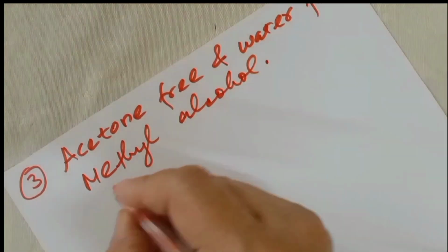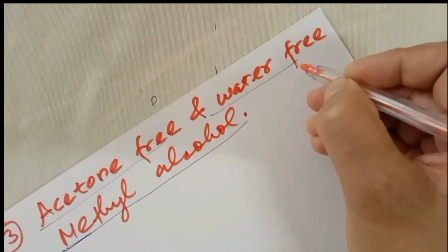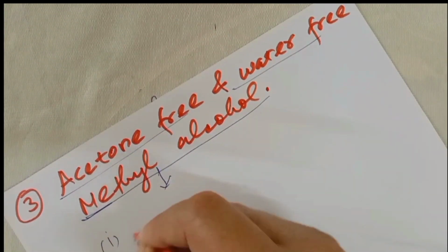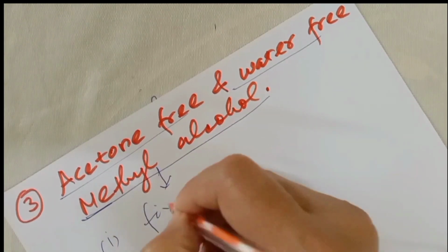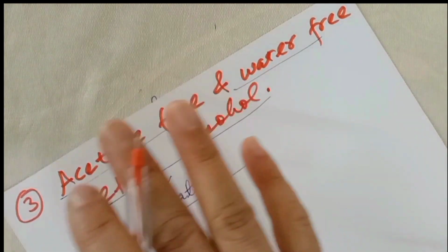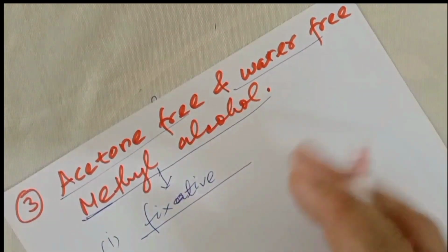So the methyl alcohol should be acetone free and water free. Okay, what is the function of this methyl alcohol here? It has basically two functions. First, it acts as a fixative material, that is, it fixes the blood smear and the blood cells to the blood slide.